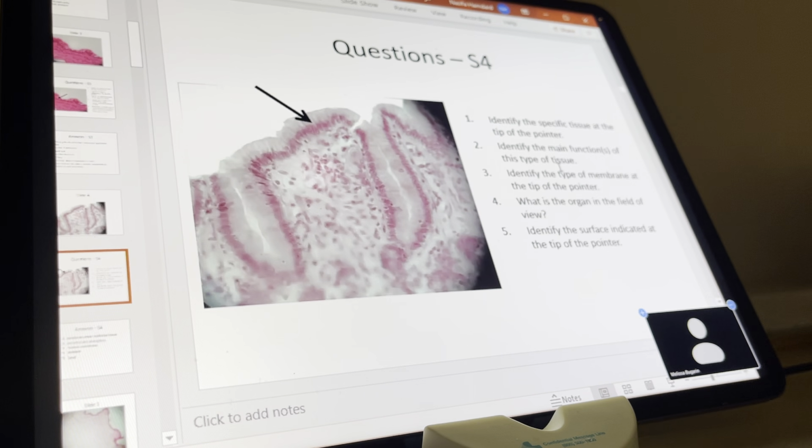Thank you. In her lab quiz review too, she marked a square to tell you that it's columnar. Yeah, good. So columnar, like a column.